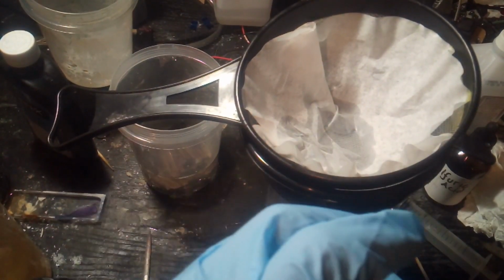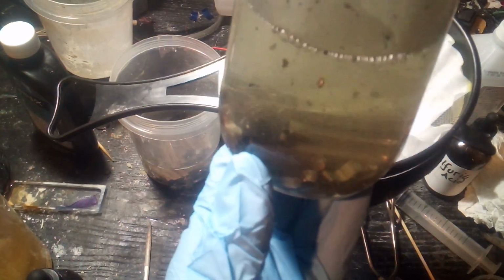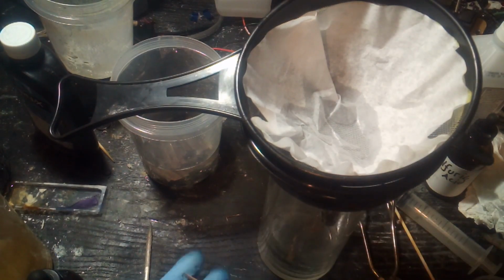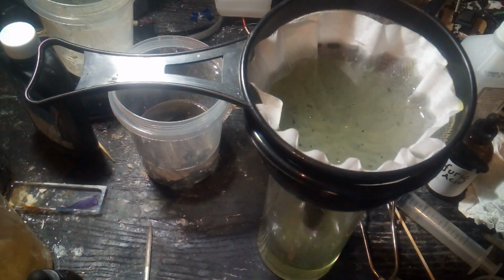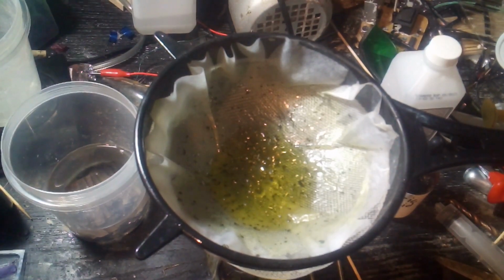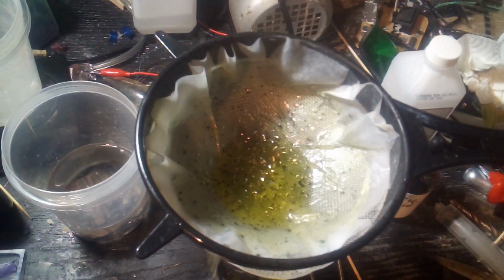The chrome-plated steel pieces have been sitting in their jar and marinating for about 4 hours now. And you can see some flakes of chromium floating around in here. So to catch those flakes, I have a filter set up, and I'm just going to pour the contents of the jar through the filter. I returned the acid to the container and shook it up again twice, and quite a bit more chromium flakes now. So I'm just going to keep repeating this process until I get all the chromium I can off of them.